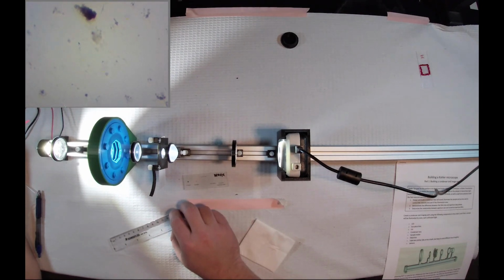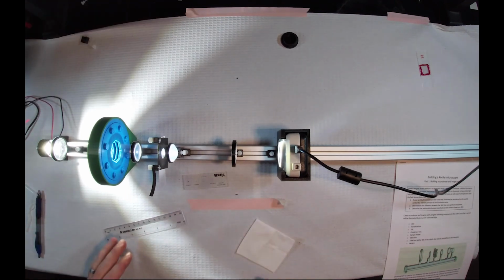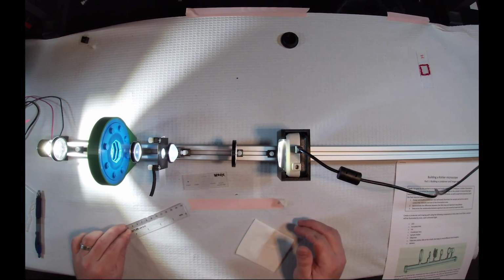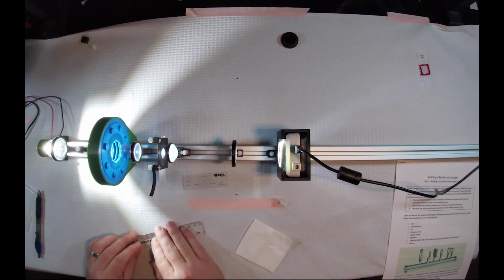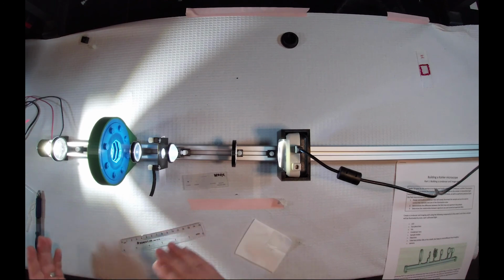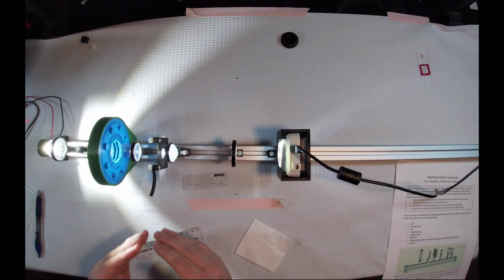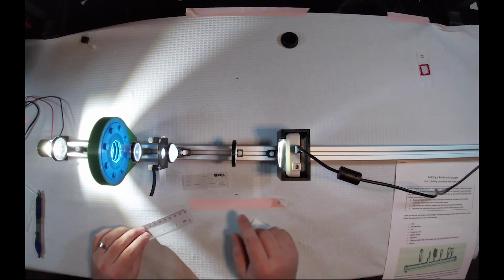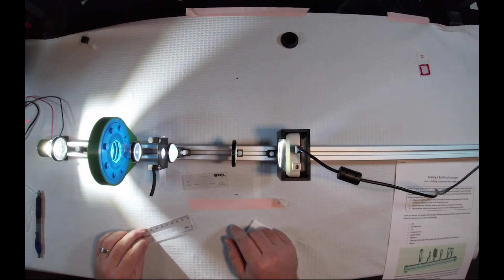So, it's okay if you find this boring, because in my opinion, Brightfield is one of the more boring aspects of microscopy, as you have learned in class. There's other things that we can do, like introduce polarizing filters or an annulus to create dark field microscopy. And that's what we're actually going to be doing in the next lab, adding in an annulus to turn this bright field color microscope into a dark field one. And with that, that concludes lab 5. Like we said, we'll pick up with lab 6, where we'll be working with dark field microscopy.